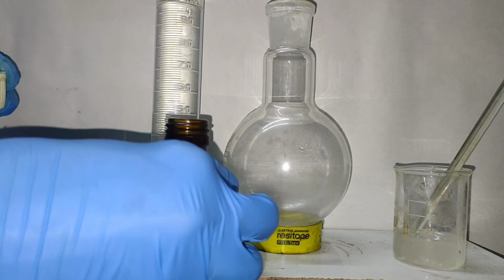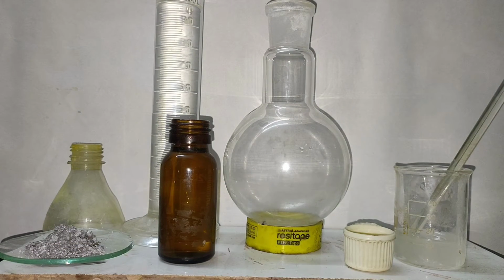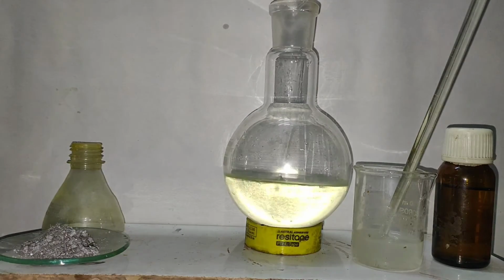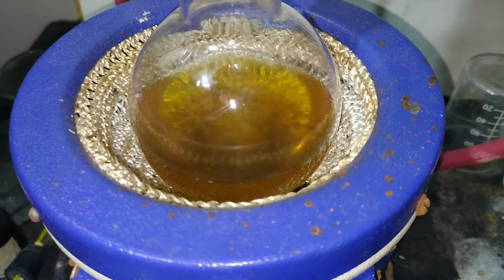So I went to my college one day and asked my sir for some nitrobenzene. He is very kind, so he gave me 30 ml of nitrobenzene in a bottle. I took out 5 ml of nitrobenzene from it and tried to reproduce benzidine using the Devarda's alloy. But this time the reaction didn't go as well as before.